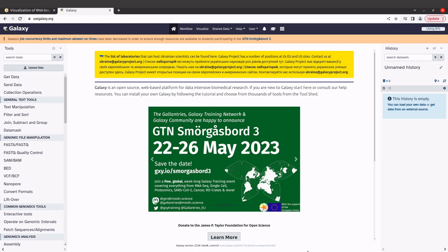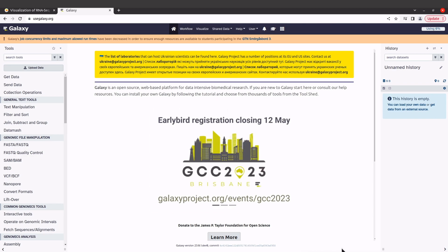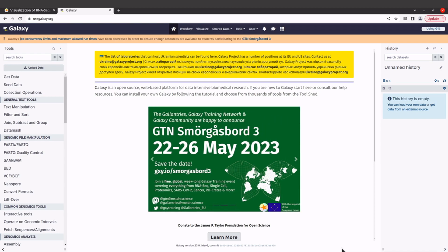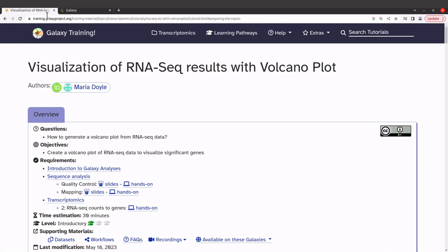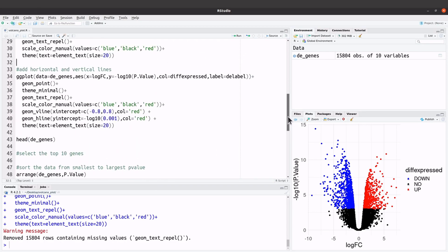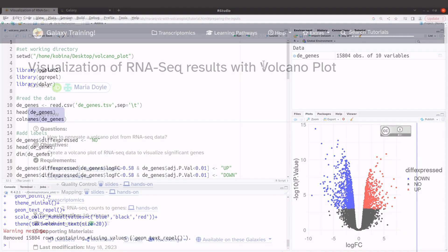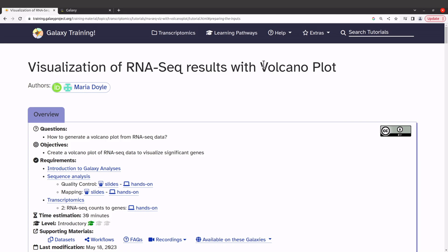First, register and get an account and log in with your details. You can still do it without creating an account, but if you do that your data will be lost after you close the browser. So I'd advise that you create an account and log in. The Galaxy platform allows you to run your bioinformatic analysis without any programming experience.